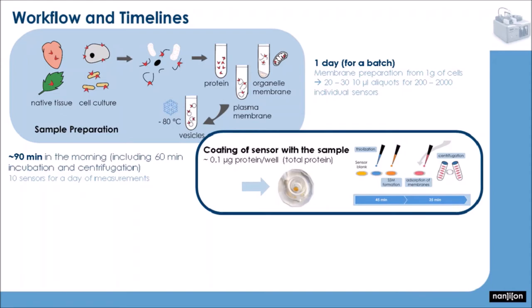On the day of the experiment, you have to coat the sensor with the SSM. That happens by different pipetting steps and takes about 90 minutes, including 60 minutes of incubation. We will show you these steps later also live.